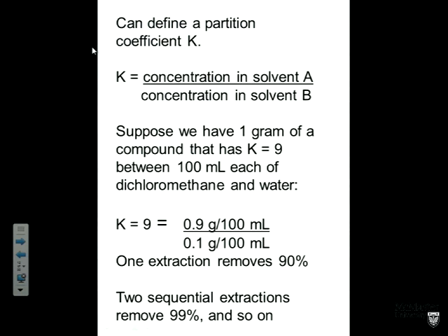So this illustrates an important point. When you're doing extractions in a separatory funnel, you need to do 2 or 3 repeated extractions in order to get a good yield. Good yield means high mark in the lab. High mark in the lab means high grade in the course. High grade in the course means go to med school, get rich, have a happy life. For the rest of you with a low yield, not so much.